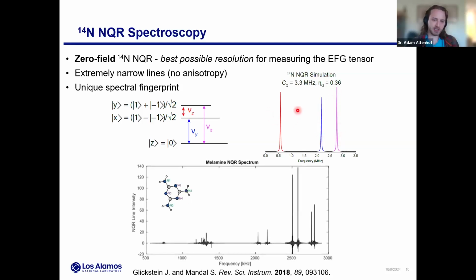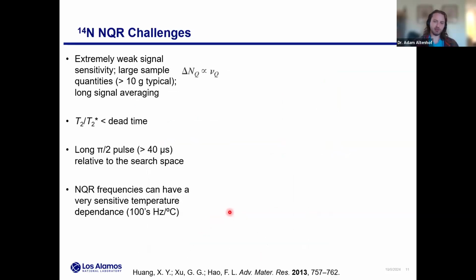Now, revisiting our friend melamine here, I mentioned this is sort of a problem at high field. There are these 6 inequivalent nitrogens. If instead we do the zero field NQR, there's 6 sites, so we expect 18 NQR lines in total. And we actually resolve about 15 of them quite readily. Some of them get pretty low in frequency, so the SNR takes a big hit. But nonetheless, this is sufficient information to do individual site identification and get the tensors. And again, this is more like what most NMR spectroscopists are used to, this sort of higher resolution spectrum, if you will, more like what we want in the detection context.